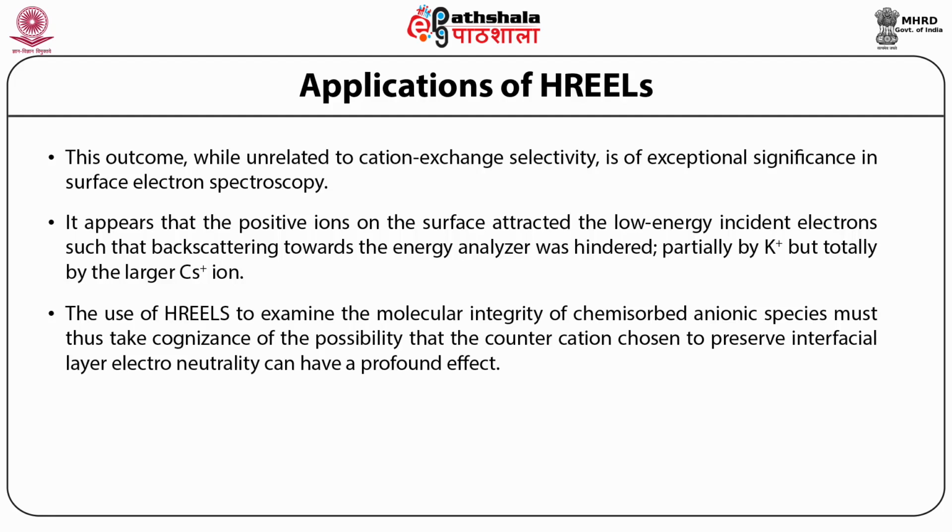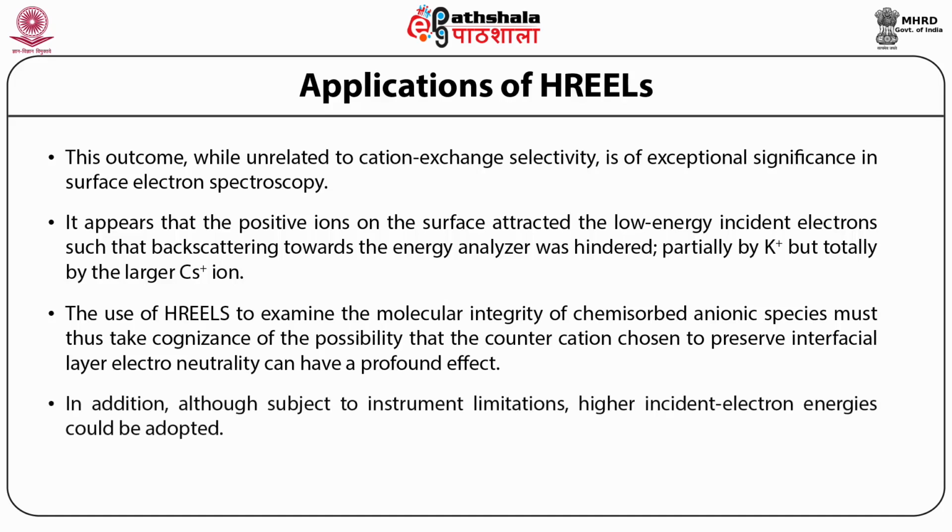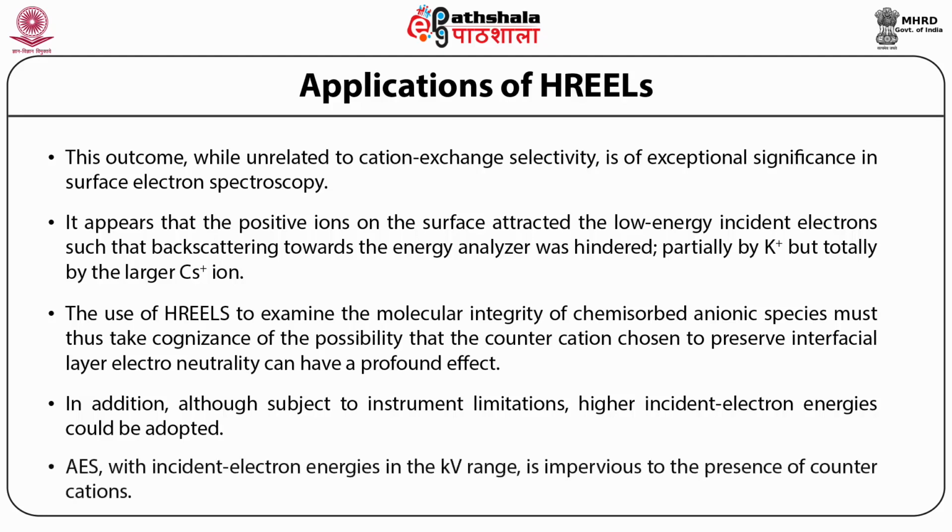To circumvent such complication, low valent and small radii cations will have to be employed. In addition, although subject to instrument limitation, higher incident electron energy could be adopted. AES, with incident electron energy in the kV range, is impervious to the presence of the counter cation.